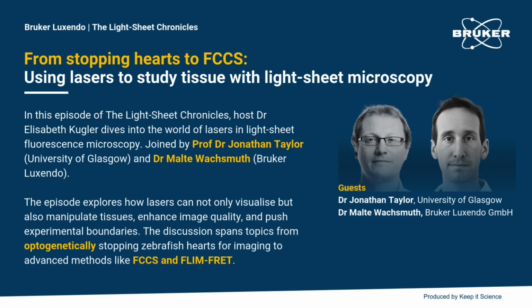And then after you really reach the limits of what's technically possible in terms of speed, acquisition, and resolution in space and time, move over to additional tricks like optogenetics or gated imaging. I think you should really push things as far as possible with full speed acquisition in the first place, and then put additional technologies on top.